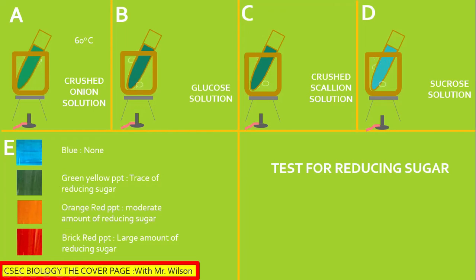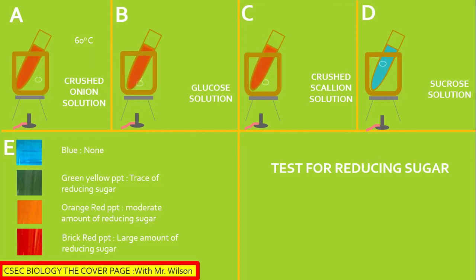We're expecting the change to be as listed here. You would have observed in A, B, and C we're getting that change. The water is still hot — steam going up there. We're having an orange color change, indicating that some amount of reducing sugar is detected — moderate somewhat. The color then moves into a nice orange toward a brick red precipitate.